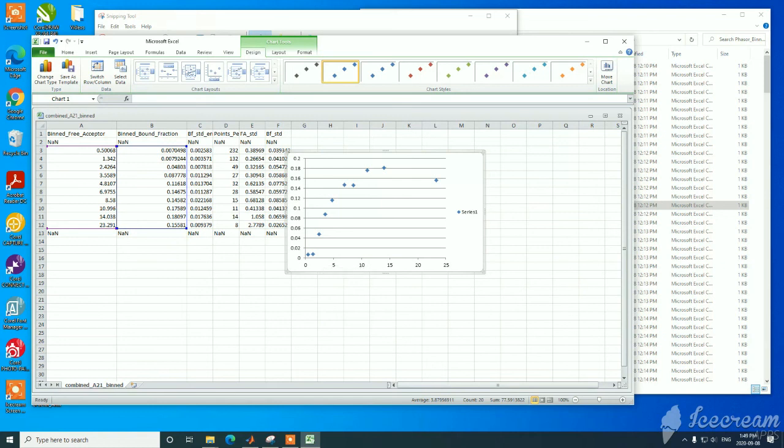The next stage of the analysis will require that we repeat steps 1 to 7 in the replicate analysis for reps 1, 2, and 3. Then we will combine the bin data for the matching transfection and treatments for all replicates.